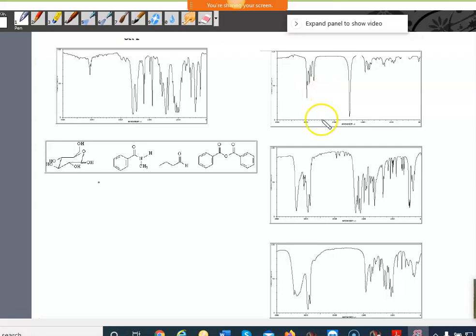All right, so we'll start with this one right here. Here's 3000 right there, and it looks like things are just to the right of 3000, but it also looks like we possibly have peaks right there. See how these two are separated and they're just hanging out there? Plus we have a carbonyl peak. So aliphatic with fangs, implying an aldehyde in the carbonyl, so that would be for this molecule right there.